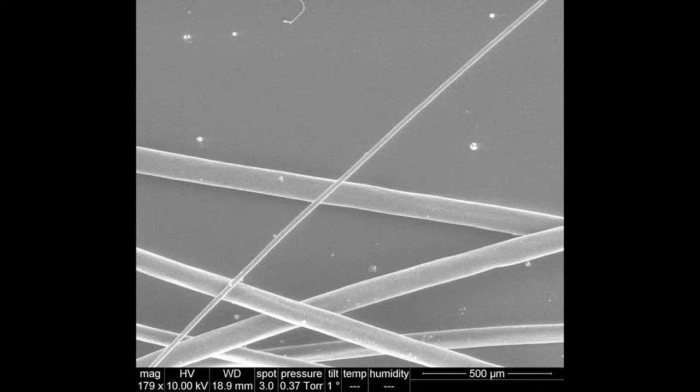Okay. So the top hairs, the much thinner hairs, are the cat's. And then at the bottom there's Mr. Gat's hair. We're going to zoom in on the features of this hair. We actually have a cat hair overlaying with Mr. Gat's hair right there. We're going to zoom in on that to show y'all the differences. In general, cat hair is much thinner than human hair. The human hair you're looking at is about 100 microns in width. The cat's hair is probably 25 microns in width.